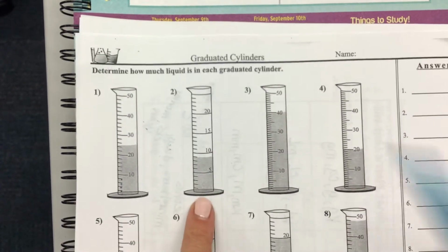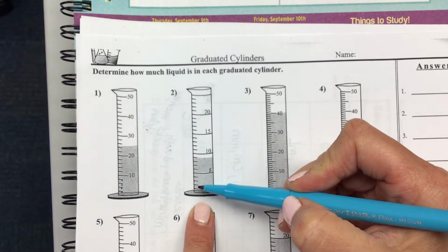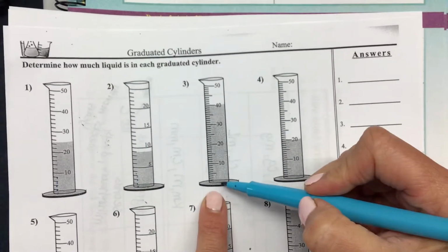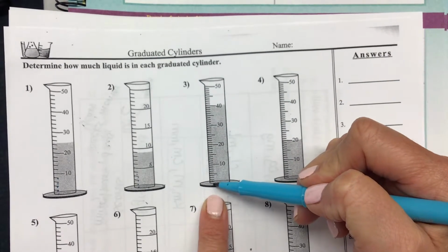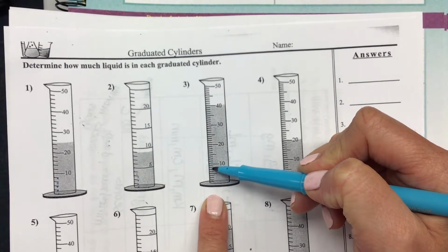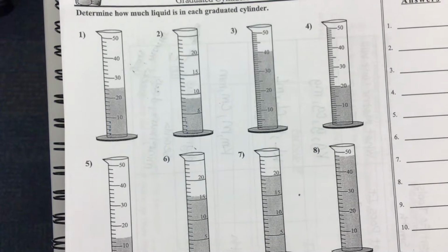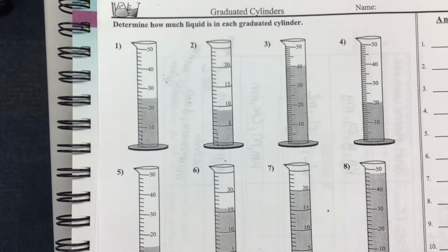Now, look at number 2. Here's a 0 and here's a 5. What is this scale? 1. Count them with me. 0, 1, 2, 3, 4, 5. It could look like this. Here's a 0, here's a 10. Look at the scale. 0, 1, 2, 3, 4, 5, 6, 7, 8, 9, 10. And then back here we're counting by 2s again. The most important thing that you have to remember is to look at the scale and decide what each one of those hatch marks represents. Okay?